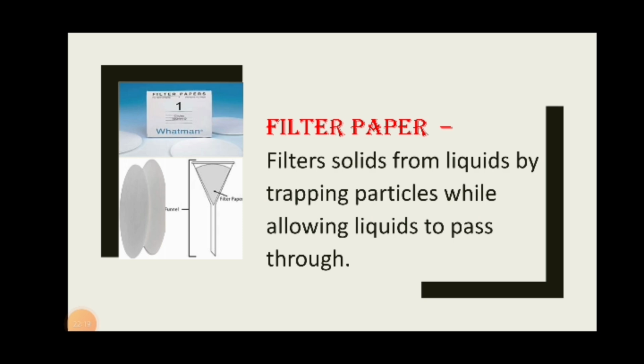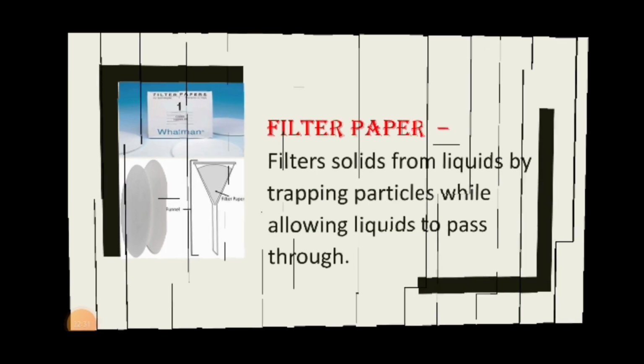Kahit ang liit-liit ng particles na solid na hindi mo makikita sa iyong mata, if you use filter paper, yes, you would see na trap siya doon. Only liquid, very small yung molecules could be able to pass through, remaining the solid part. And then you weigh it using filter paper.